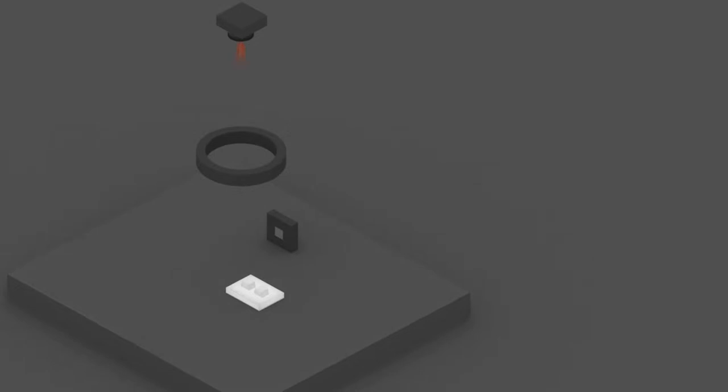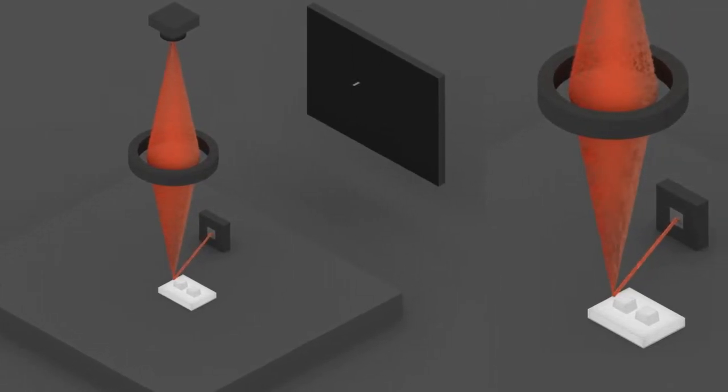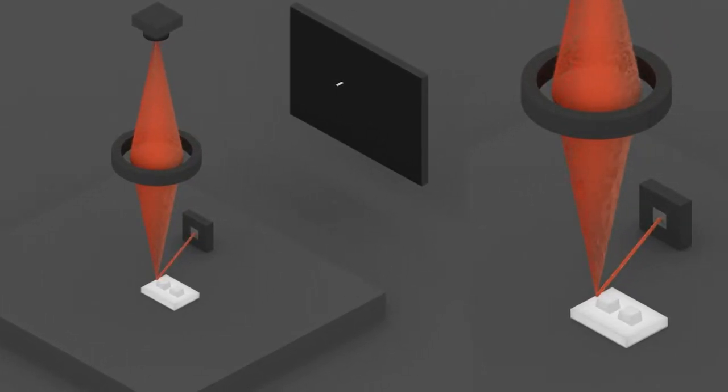In a SEM, a beam of high-energy electrons is focused to a tiny dot on the surface of the sample. The beam is controlled to scan over the sample surface. At each point, the focused high-energy electron beam kicks out lower-energy electrons inside the sample, which are collected by a detector.